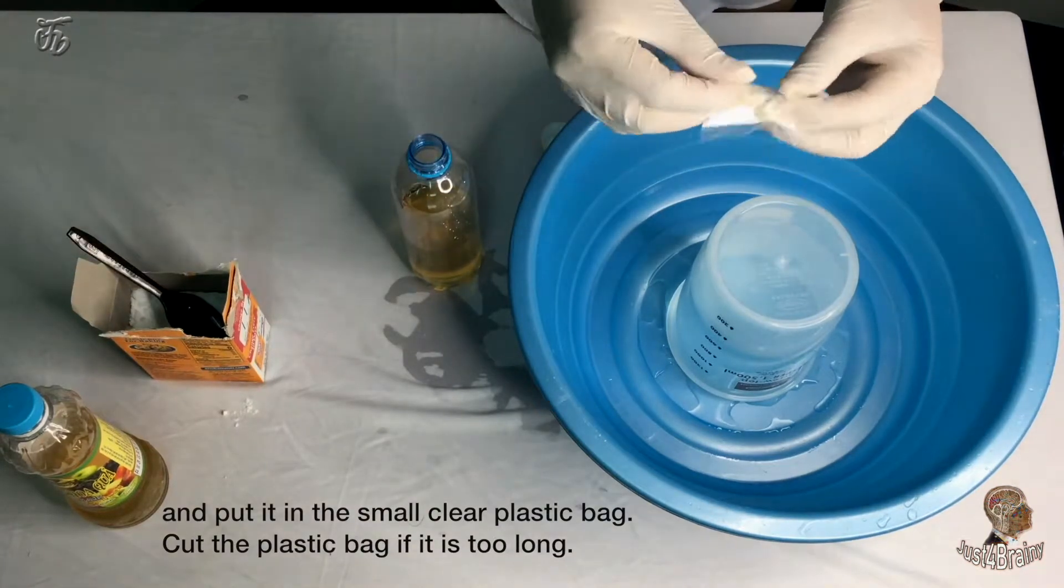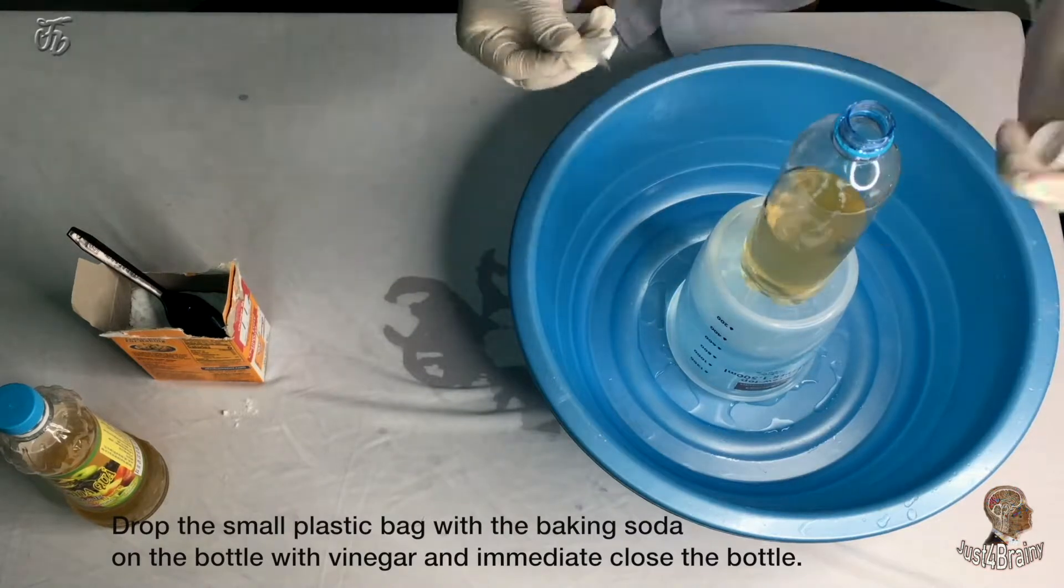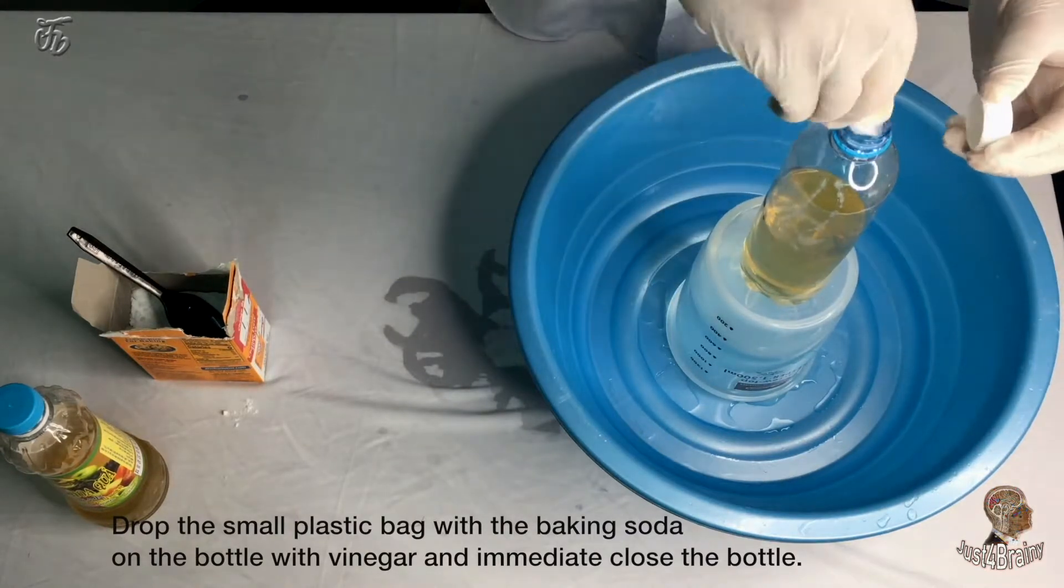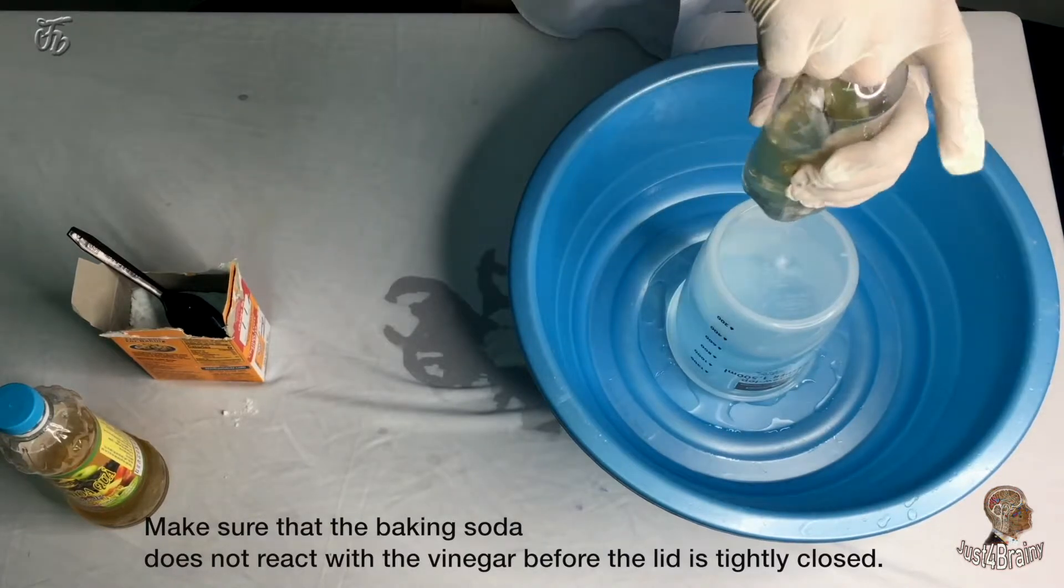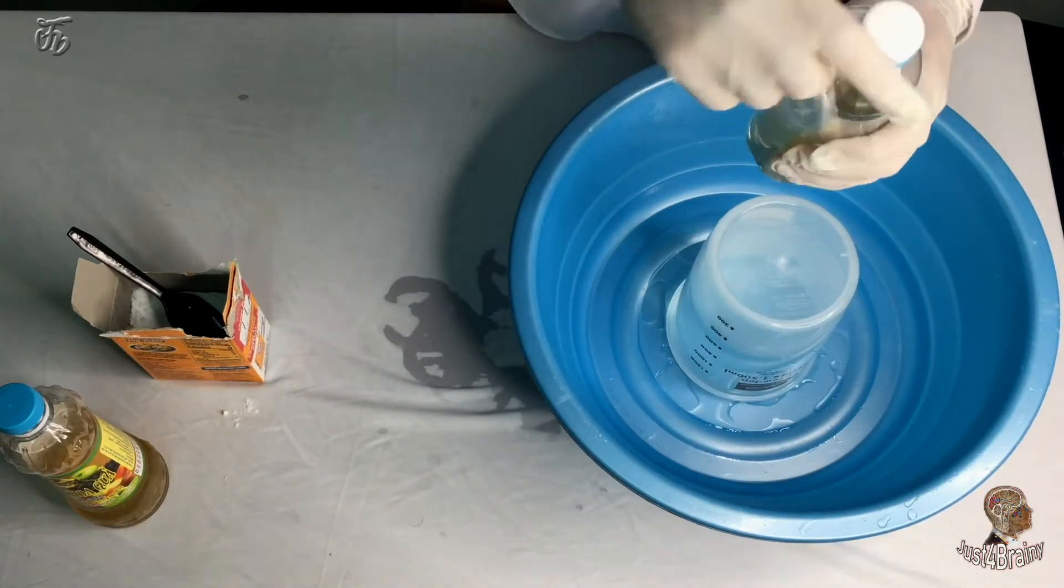Cut the plastic bag if it's too long. Drop the small plastic bag with the baking soda in the bottle with vinegar and immediately close the bottle. Make sure that the baking soda does not react with the vinegar before the lid is tightly closed.